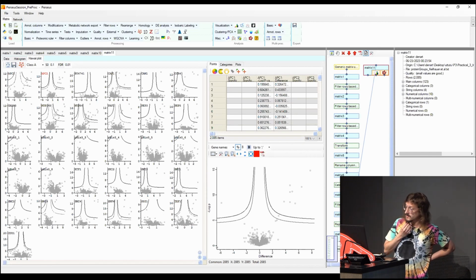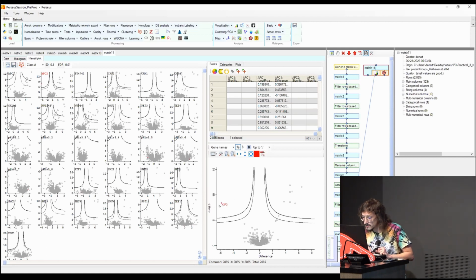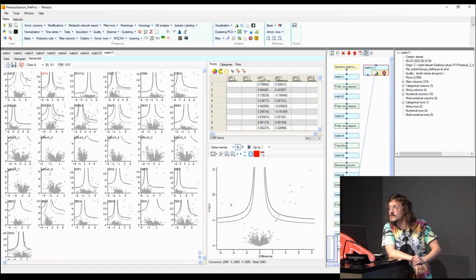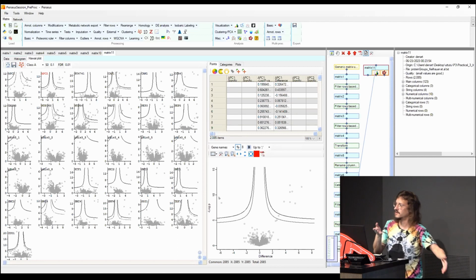Well, in this case, you don't expect to find a negative significant one. Exactly. It's a random error, something that happened. But if you then specifically go here, let me see if it's correct. No, it's an error. In other graphs, it was the histone, because for some reason, the control group that was used as a histone then appeared there. But usually, you don't expect a protein with a bait to be less expressed.